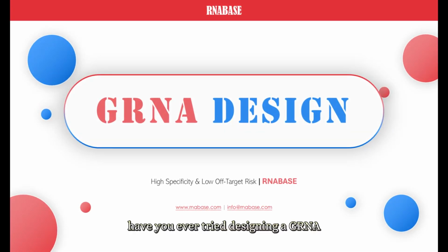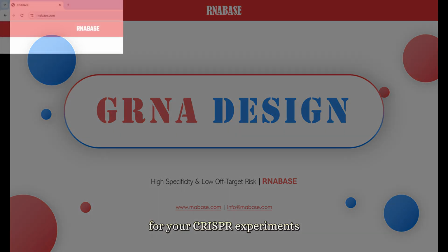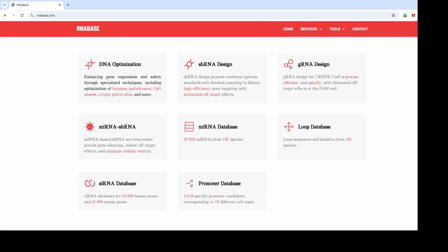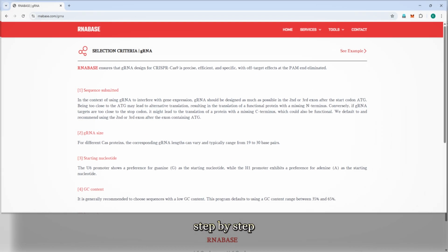Have you ever tried designing a gRNA? What are the key factors to consider when creating one? What makes a gRNA truly efficient, specific, and with minimal off-target effects? If you're looking to design the perfect gRNA for your CRISPR experiments, RNABase is here to guide you. In this video, we'll show you how to design a high-efficiency, high-specificity gRNA with low off-target risk, step by step.